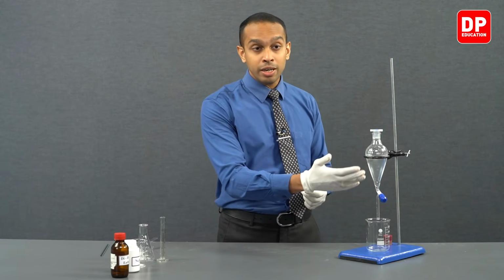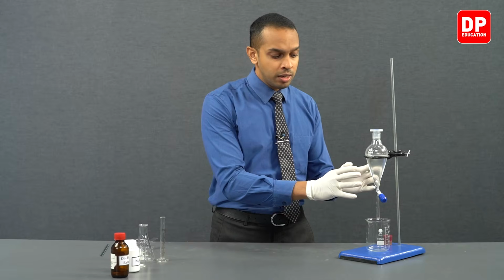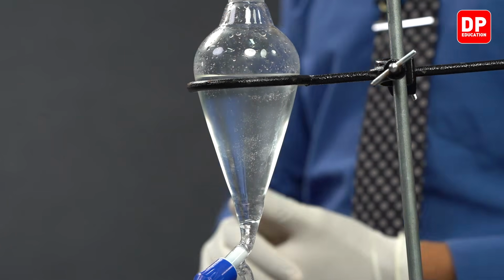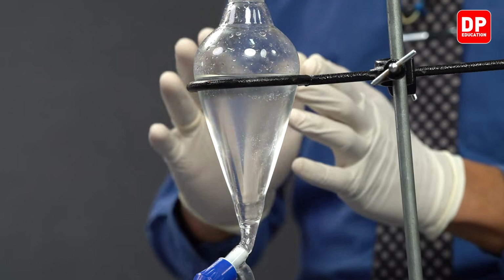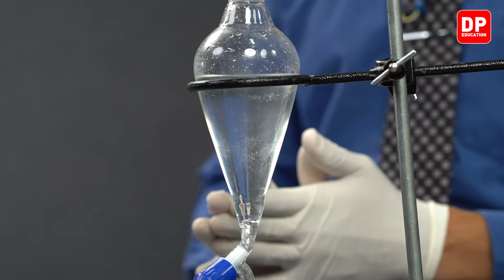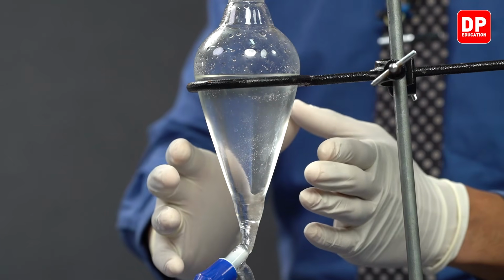You can see earlier on, before we added the diethyl ether, the aqueous layer was very cloudy in nature. But after we added the diethyl ether and mixed it with the diethyl ether, we saw that the aqueous layer got slightly clearer.